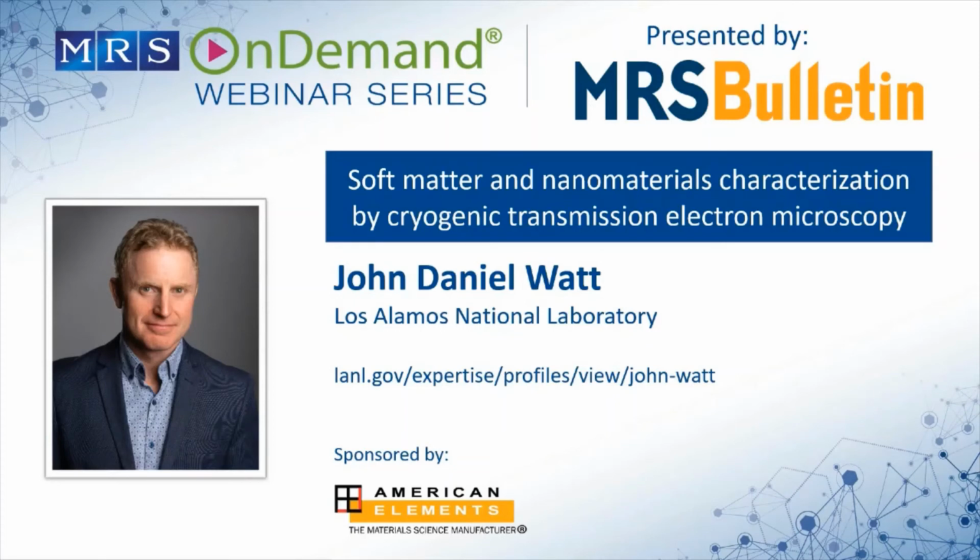Yeah, absolutely. I don't think we're looking for, as you mentioned already, developments in terms of holder technology, and certainly if we want to avoid stray signals from an X-ray detector, then there's a lot of design elements that would need to go into holder design and lens design as well. Right, and considering drift, and also making sure that your vitreous ice background is very clean and clear of any contaminants, so that you're not getting stray signal from that, because now you don't just have a carbon film whose composition is known. Yeah, indeed.